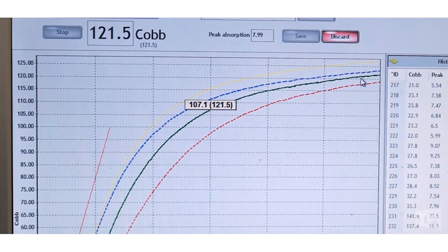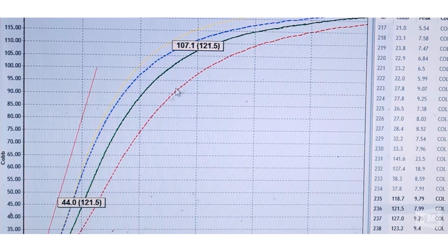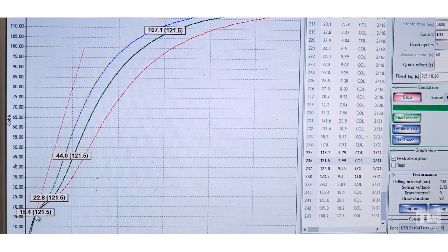We do want to see the Cobb value, but we also want to see, more importantly, how the chemicals react to the paper. In other words, this one here is absorbing a lot less than this one, as an example. So we're looking at this initially, and then we're looking at the curves, difference in curves, which is difference in chemical addition.